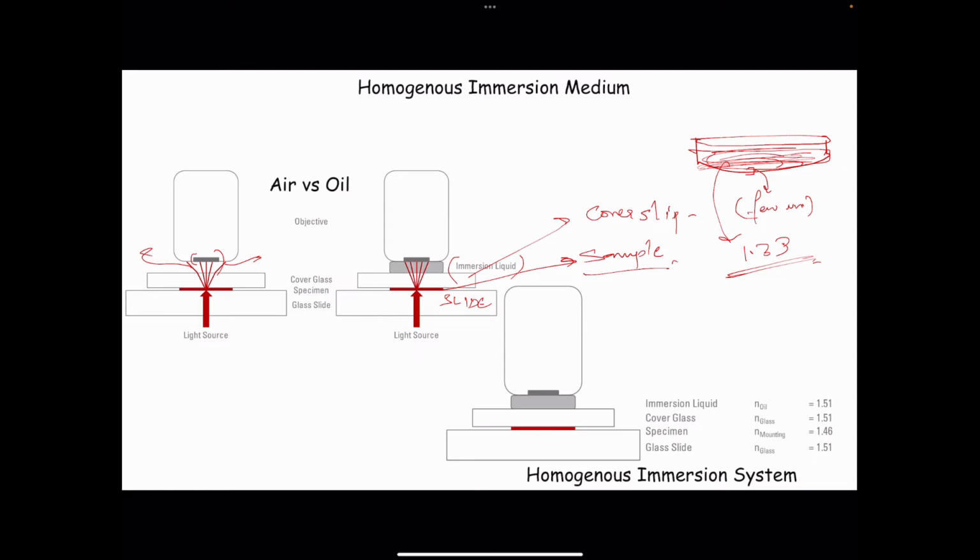However, even after you fix the sample, you need to keep the sample hydrated, and to do that, you have to mount your sample before imaging, and you have to do it with some mounting media. There are several commercially available mounting media, such as Mowiol, Vectashield, or similar mixtures containing water and glycerol plus various other chemicals such as anti-fade and other preservative substances, which will preserve your sample for a longer time.